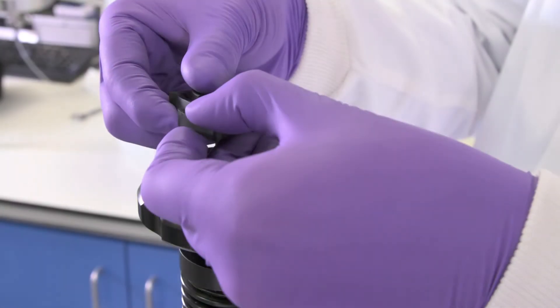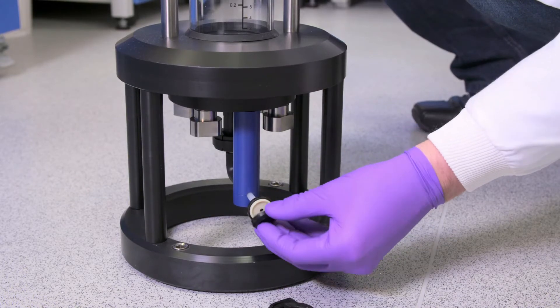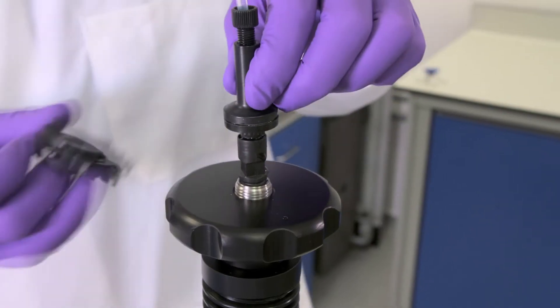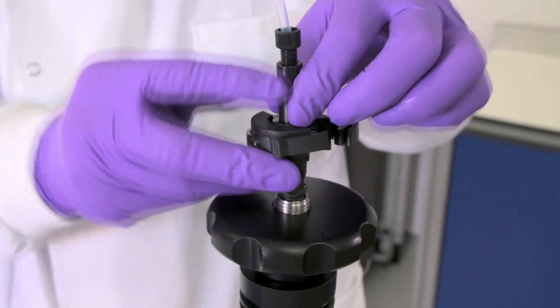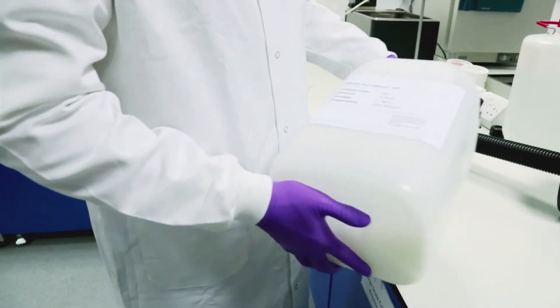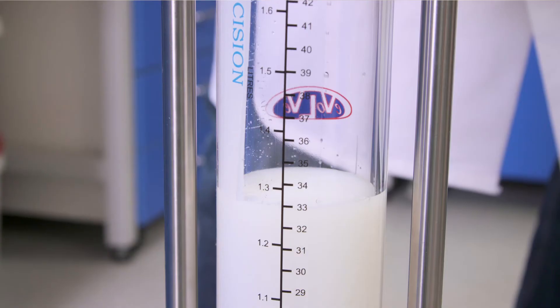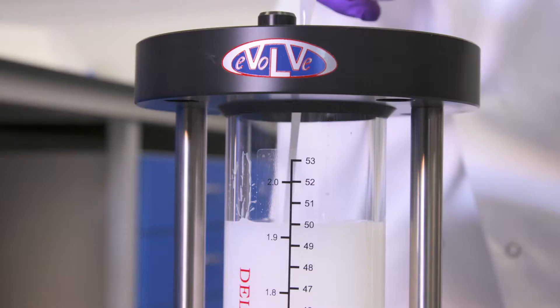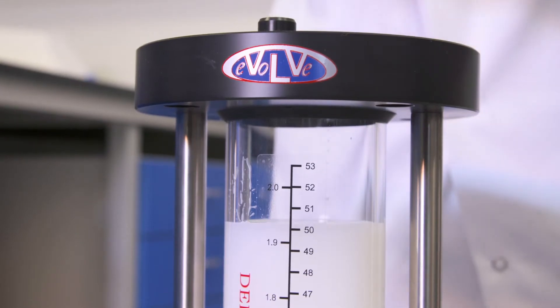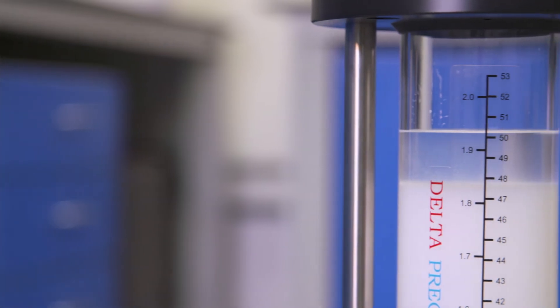Remove the click clamps and end pieces from the top and bottom of the column and attach suitable tubing. The click clamps can be reused for reattachment. Slurry the absorbent and carefully pour the desired amount into your column. Once the storage solution begins to drain, close the bottom outlet.